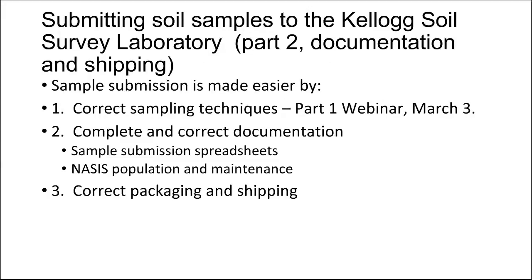Submitting soil samples. As I said yesterday, we talked about the actual sampling techniques. Once we have the samples, the next step is the documentation and submitting of the samples. And then finally, we'll talk about the actual packaging and shipping.